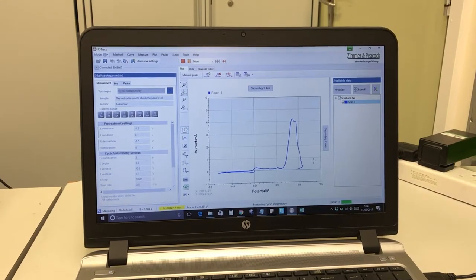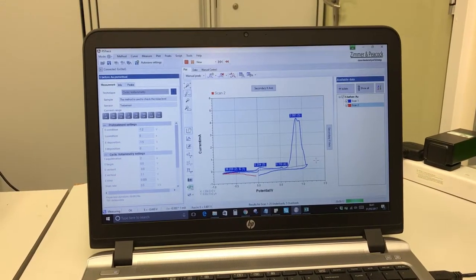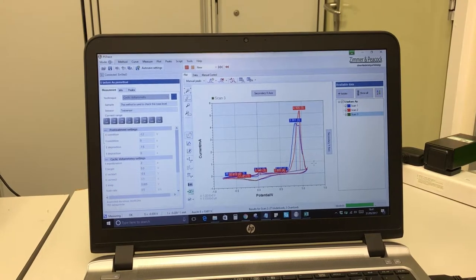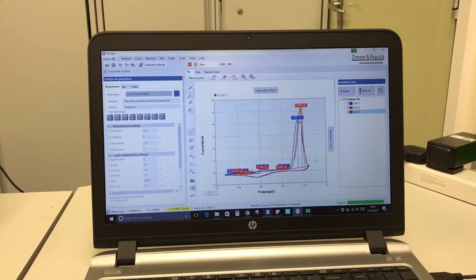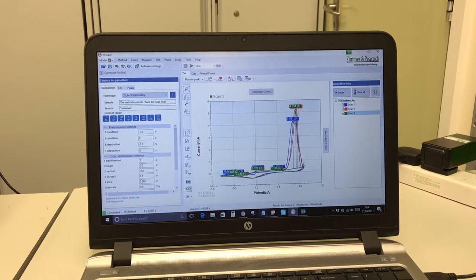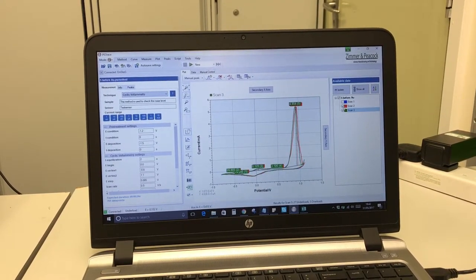So we have modified the sensors with gold nanoparticles to increase the surface density and also to make it much more suitable for different kinds of application, using, for example, one of those like the thiolated DNA aptamer. So now we have performed our 3 cycles of cyclic voltammetry with the sensors covered with gold nanoparticles.